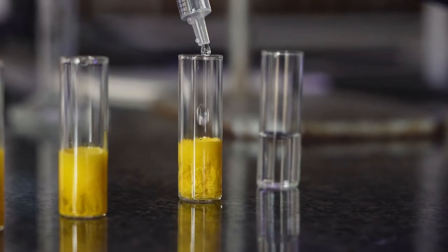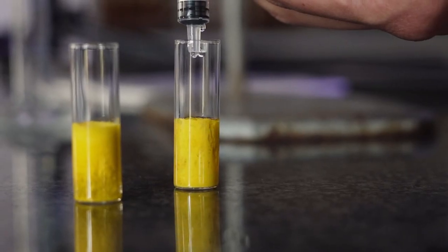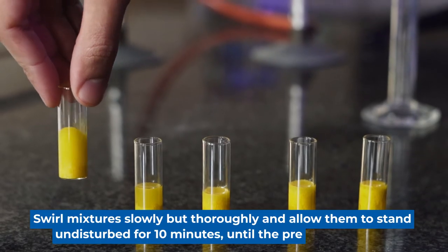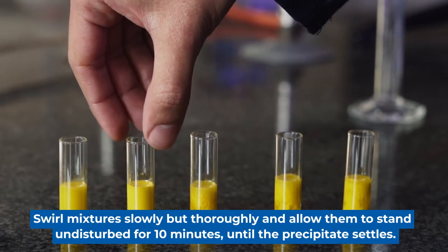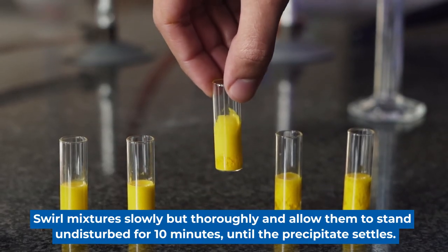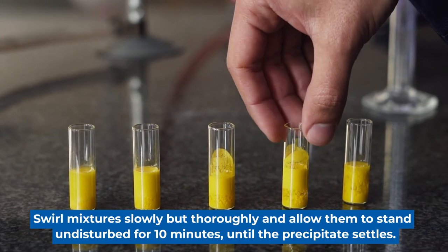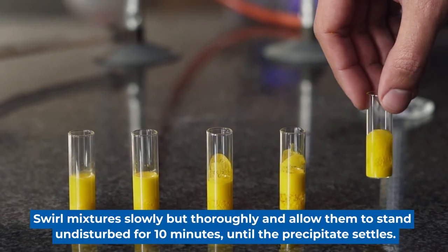Once all of the vials have been made up to three cubic centimeters, we need to swirl all of them to make sure that all of the lead nitrate, potassium, and iodide ions can react with one another.